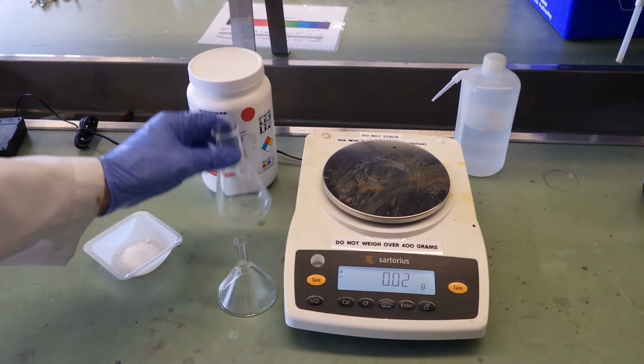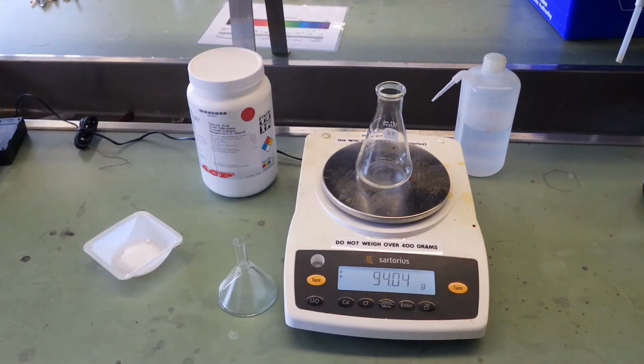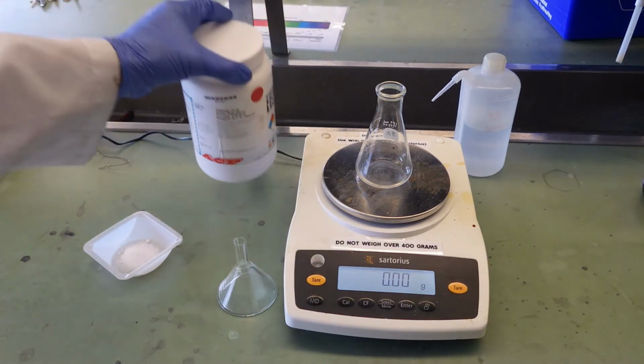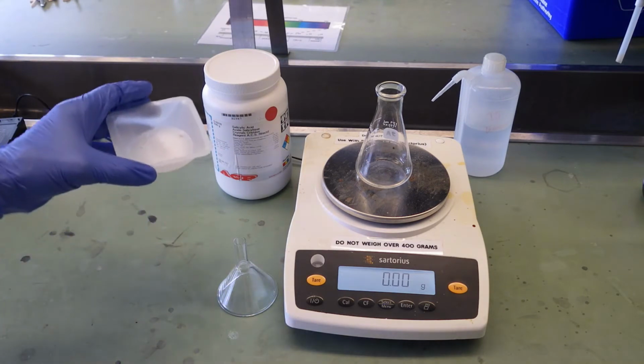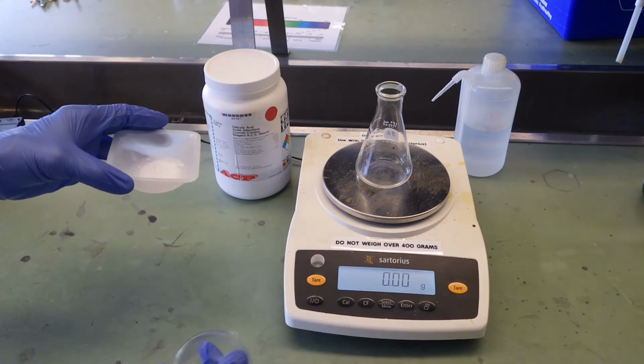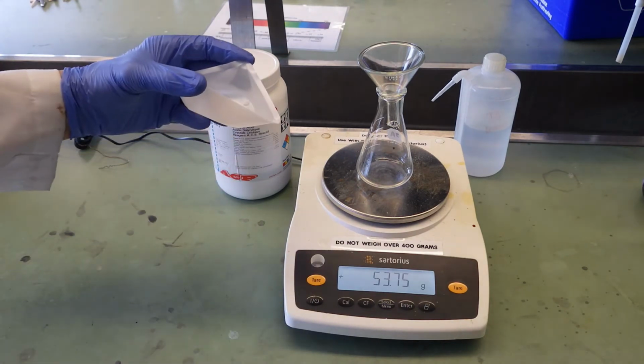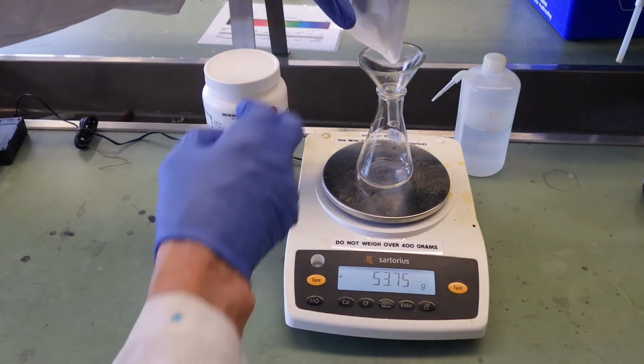We start by weighing about 3 grams of salicylic acid. I've already got that quantity in the weigh boat. Anytime you're going to transfer a solid, make sure you use a powder funnel. That way the solid gets into the flask, not on the balance and not on the lip of the flask.